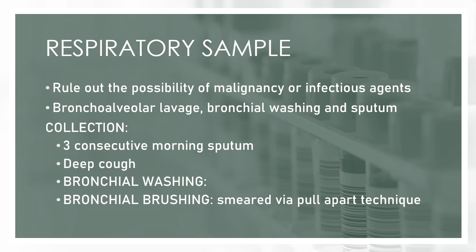If the patient cannot cough, then you use something that will induce coughing. Accordingly, they use inhalation of aerosol solutions for 20 minutes, which will induce cough. Again, you have three consecutive morning sputum here.